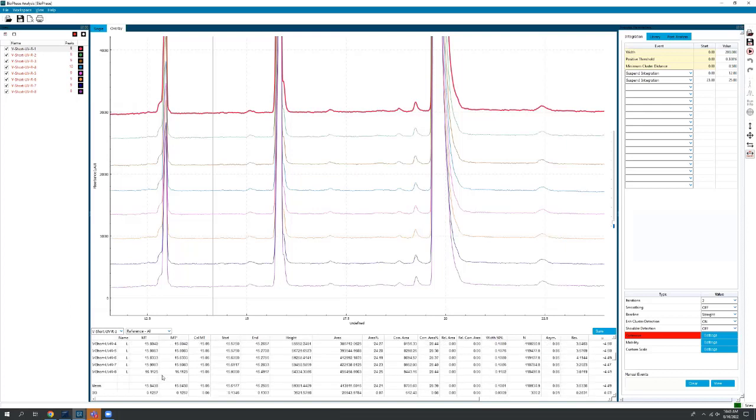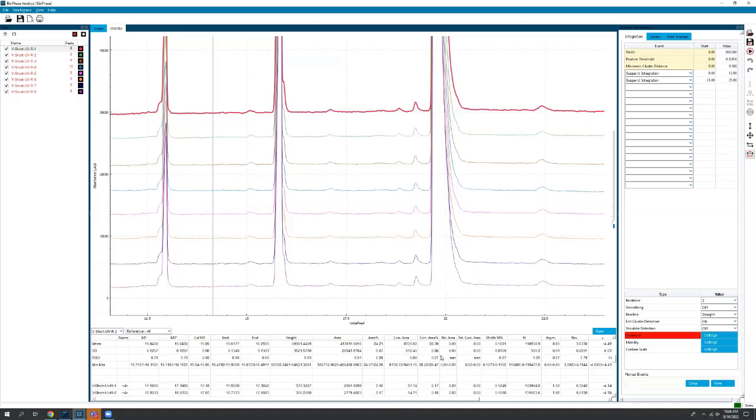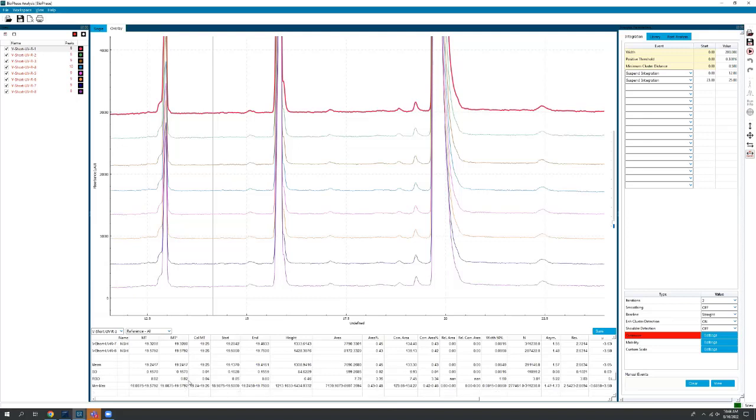Here's our light chain peak. RSD is less than 1% for migration time. For corrected area percent, it's less than 0.3. Look at our non-glycosylated heavy chain. RSD for migration time is again below 1%. Corrected peak area is a little bit higher.